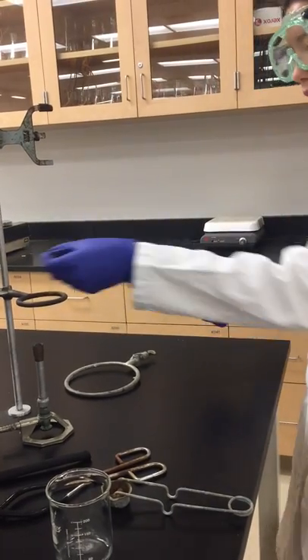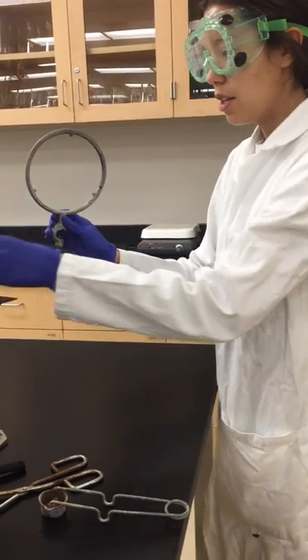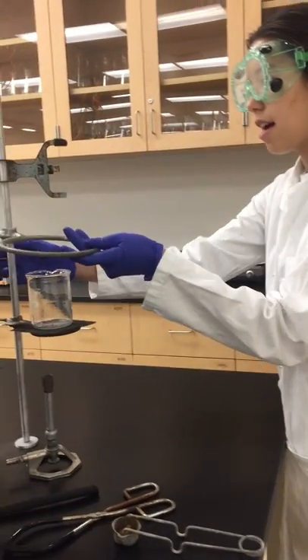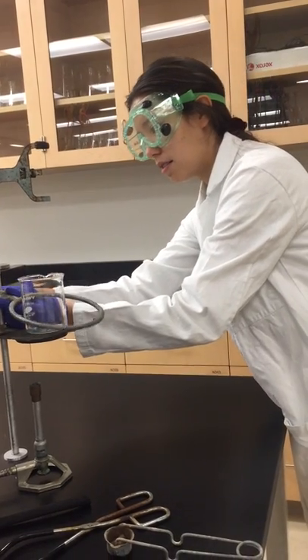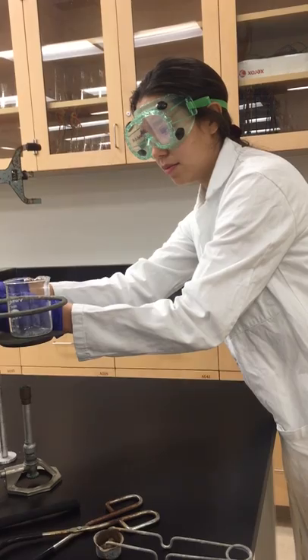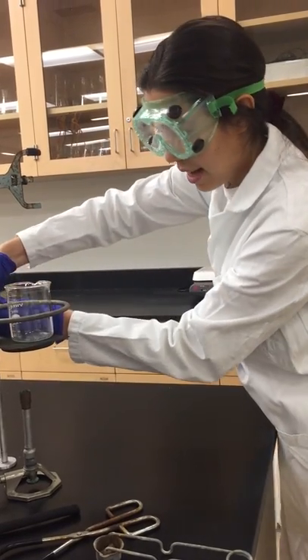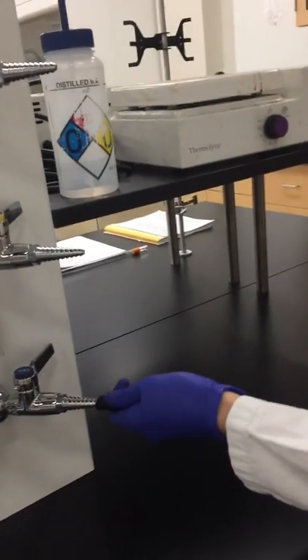Next, we're going to place the wire gauze on top and attach the second metal ring so that it's about 2/3 the height of the beaker and secure it to the ring stand. Like that. Next, we're going to attach the rubber hose to the gas supply and to the Bunsen burner.